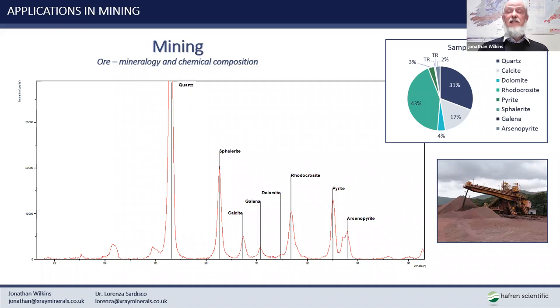And of course, it is a surprise sometimes to people to learn that if you would take petrography, for example, where dolomite and calcite are very, very similar in their optical properties and actually quite difficult to tell apart, in X-ray diffraction, they are not. They are very, very distinctive minerals which cannot easily be mistaken, although there are problems of overlaps sometimes which make the interpretation process a little bit more difficult because of interference from other minerals, not necessarily other carbonates. And this particular picture actually illustrates three carbonates. There is calcite, there's dolomite, there's rhodochrosite, very, very clear peaks.